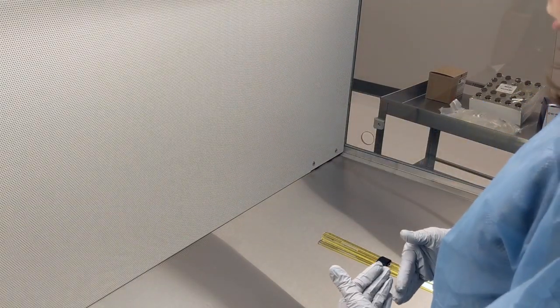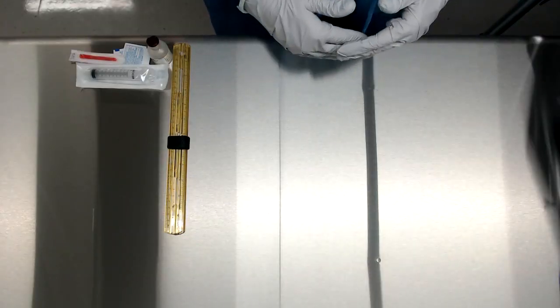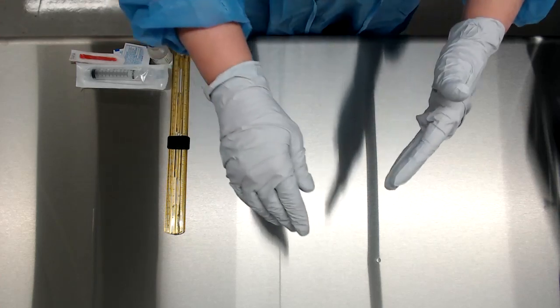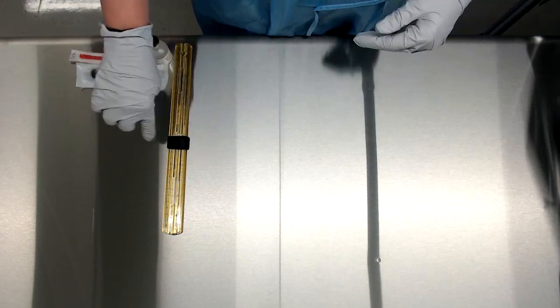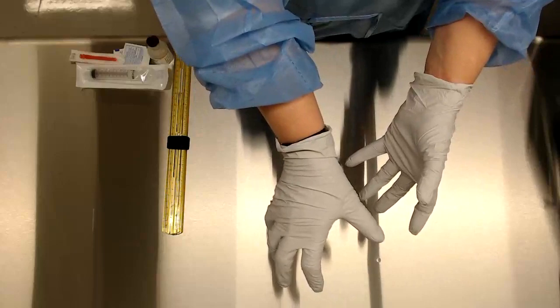As you get closer to the edge of the hood, turbulence exists. So we don't want to work at the edge near where you stand. We always want to work six inches in. Today I have a ruler here to show you. This little black mark is where you want to work beyond, so that you're in the sterile field.